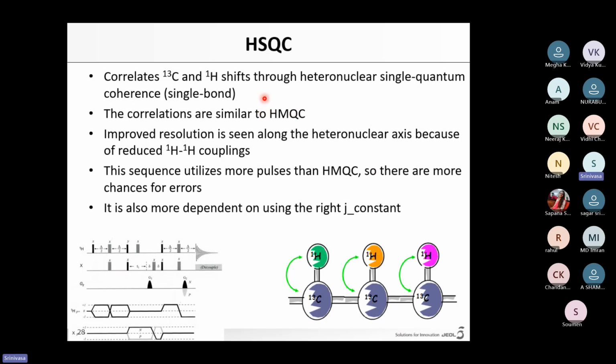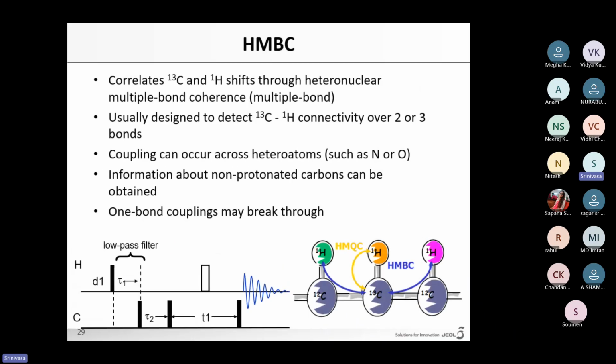But the HSQC case is universal, where decoupling is applied. So the contours are very tiny and very crystal clear. You can see that. Both give the same information.